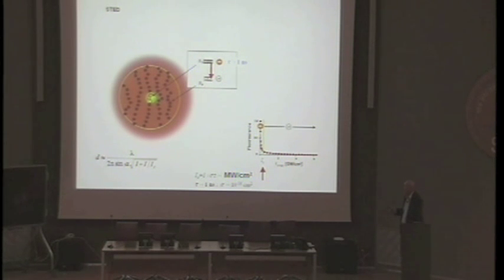Because the lifetime of this state is just 1 nanosecond. So this difference in states that we critically need to separate the features is there only for about a nanosecond. We have to hurry up to create a difference in states and register that, otherwise the difference is gone. This is why we have to put in light so quickly, meaning high intensity, because we need to set up this difference in states within a nanosecond. It's not going to stay there for longer.